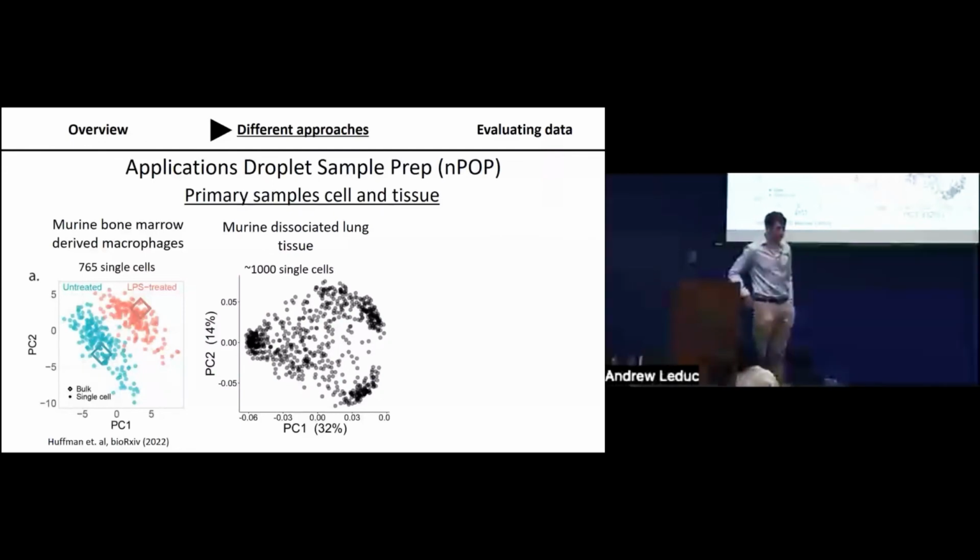Nicole asks, reducing the volume to 20 nanoliters on chip, comparing with the 5 microliters of the 384 well plate, is only the volume of the lysis or enzymolysis reagent reduced? Compared with the two, how much is 20 nanoliters increased?